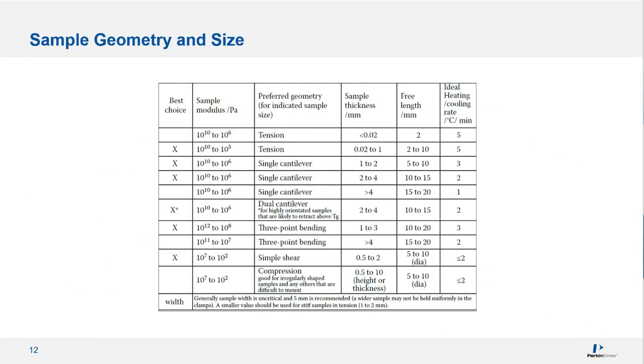So now I have a material. How do I test it? What geometry, and how big or small does the sample need to be? The choice of geometry you run your sample in is dictated by the sample's physical state at the beginning of the experiment, its difficulty in loading, and the experiment you want to run.